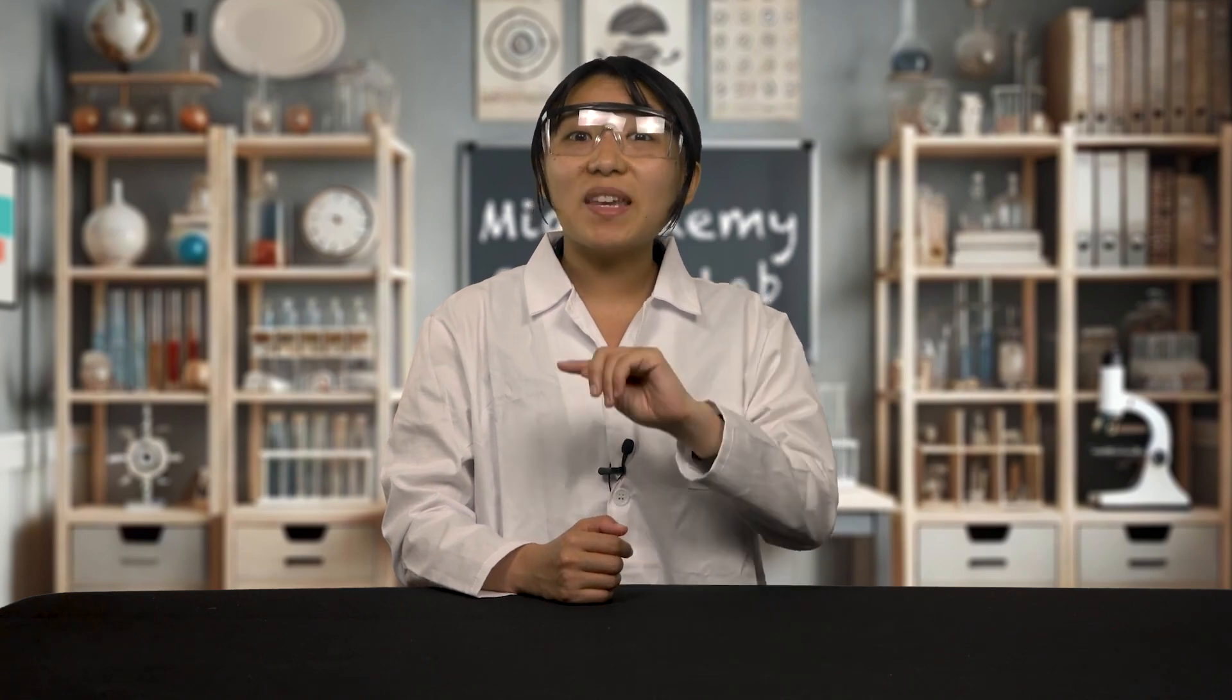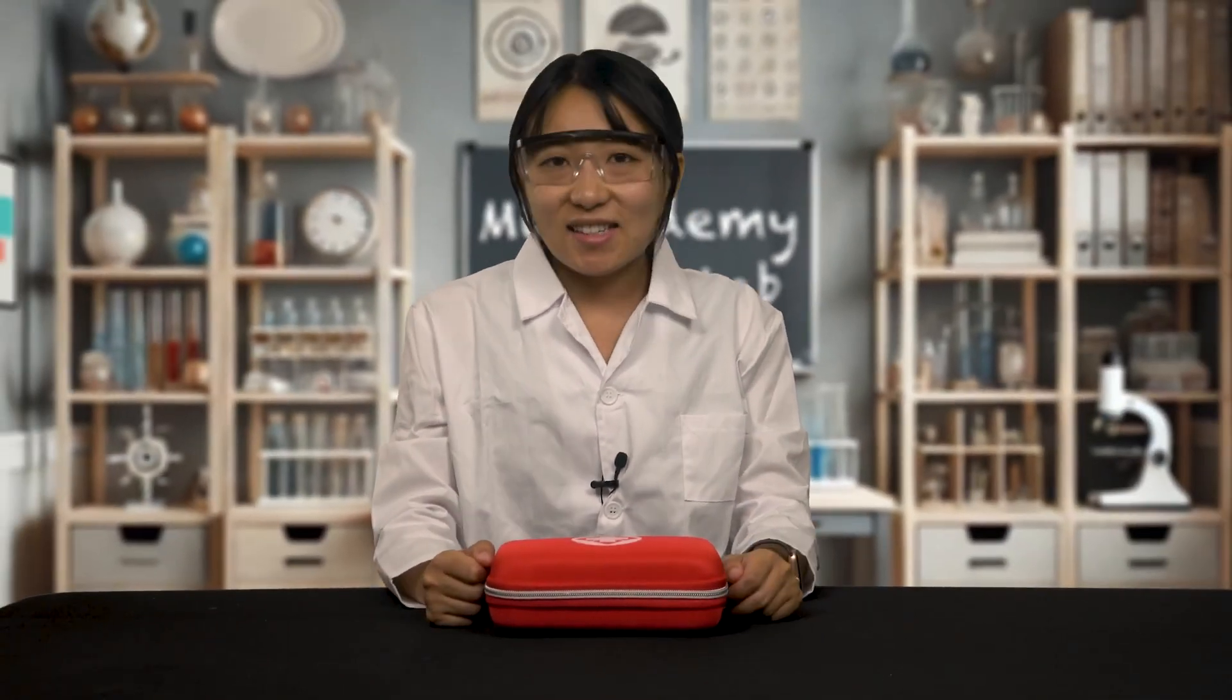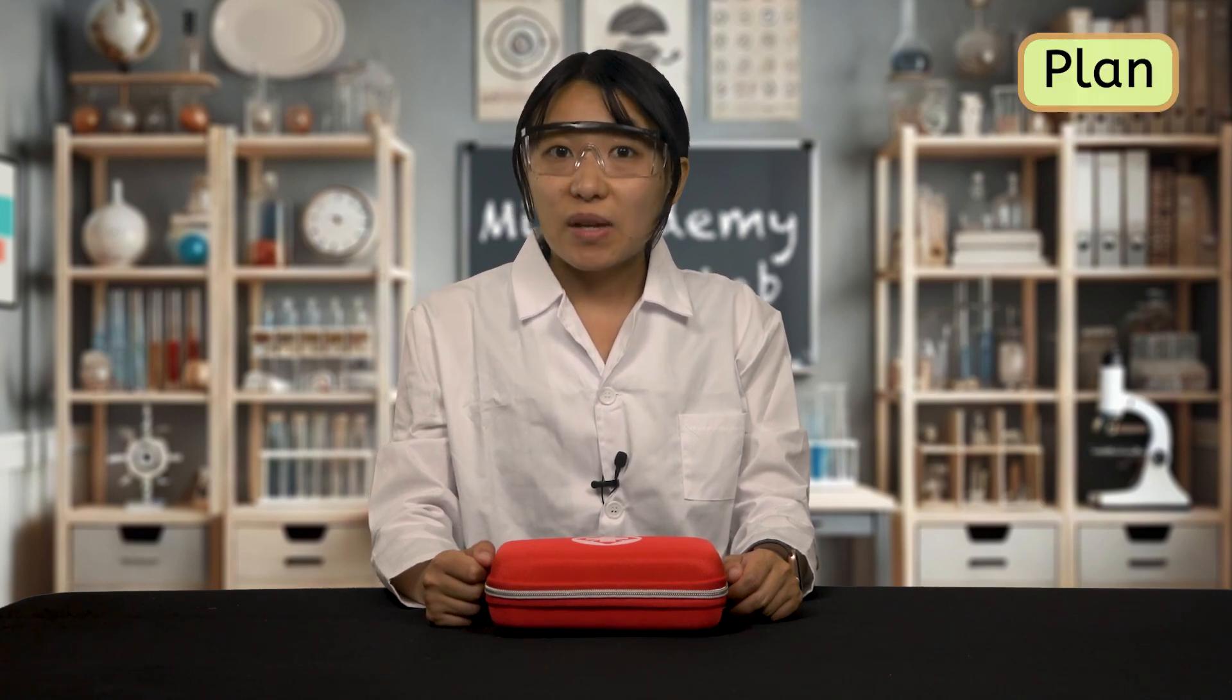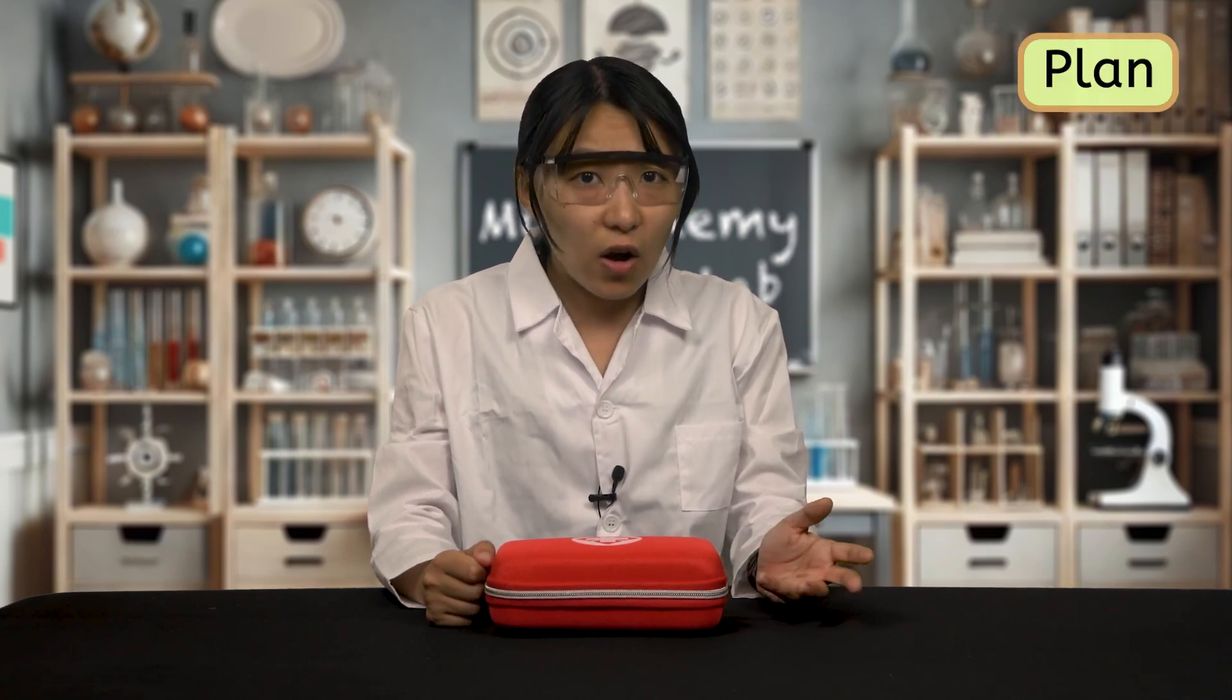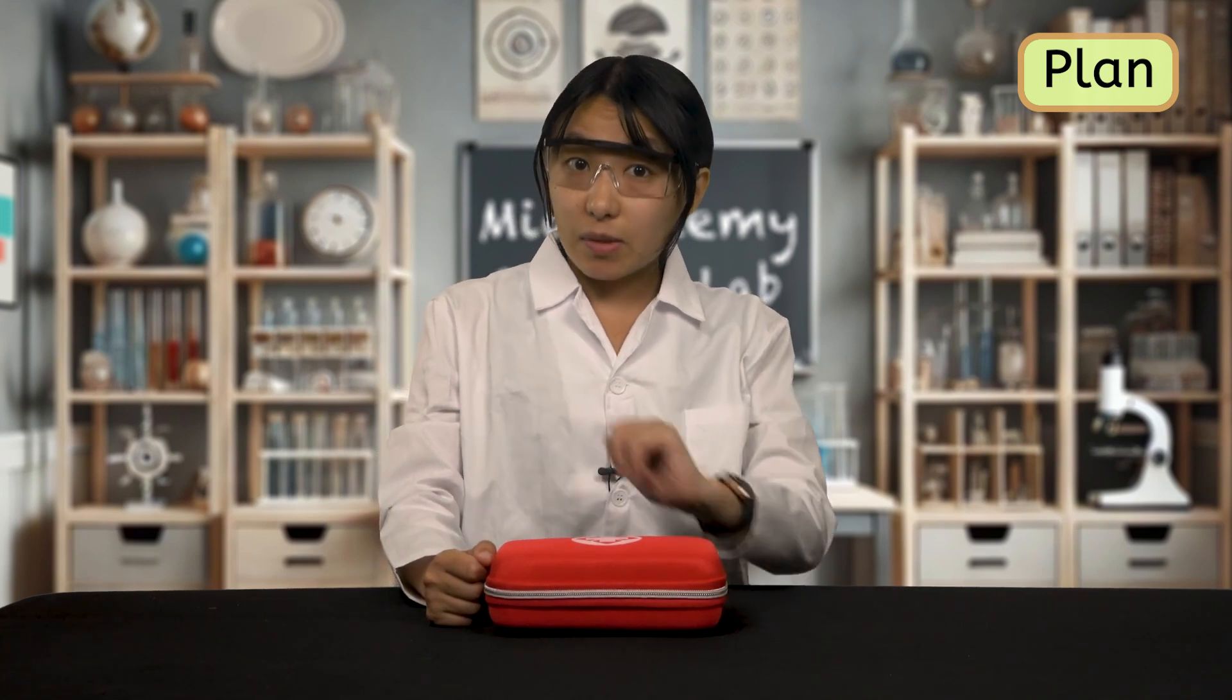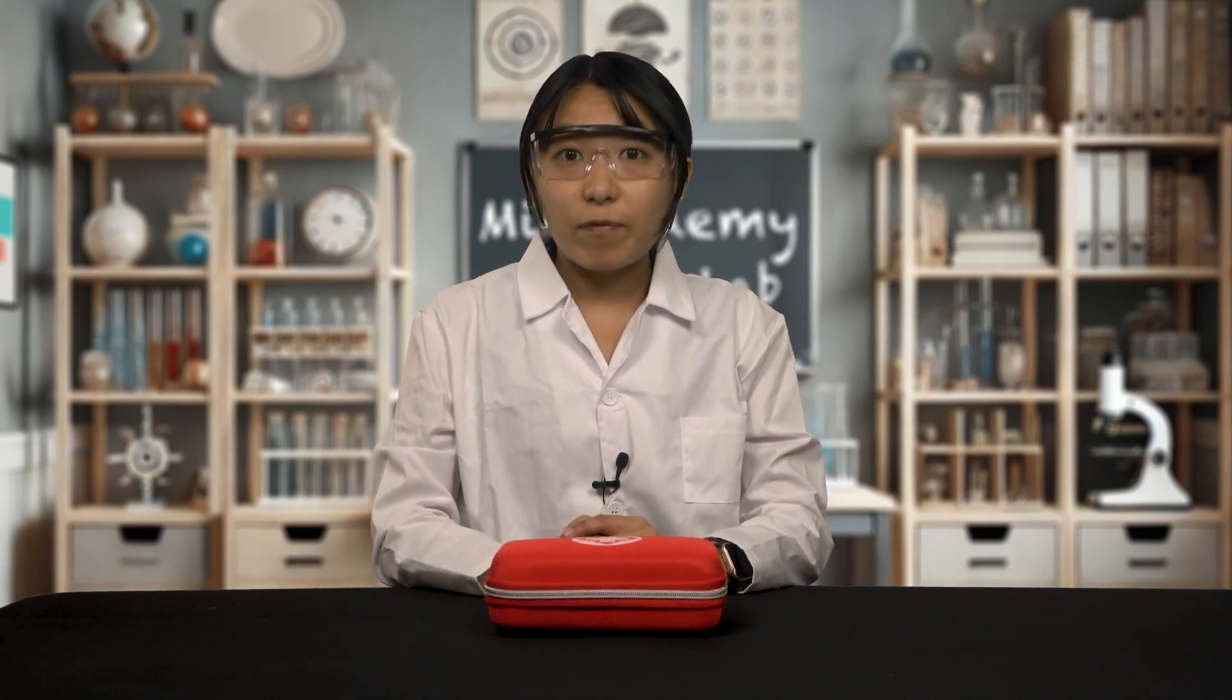This is where the final P comes in, your emergency plan. Even when you prepare, protect, and prevent, accidents can still happen. So having a plan for emergencies is crucial. It's like knowing what to do if you fall during a soccer match. You've got to be ready to respond. First, never complete a lab without a parent or guardian at home. You want to make sure you have backup in case of an emergency during the lab.